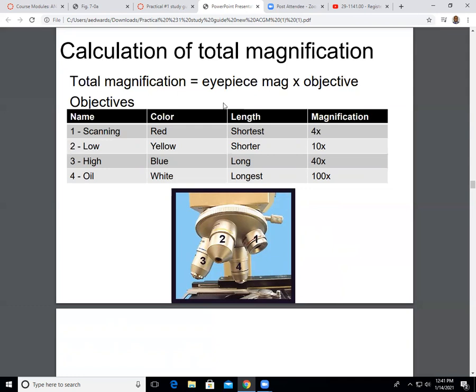Being able to see some depth or thickness in your field, we call that depth of field. If you change the objectives, the object remains in relatively good focus, we say that's parfocal. And we'll just make sure we remember the area you can see in the microscope when you're looking down at the microscope, we call that the field. Okay. All right.